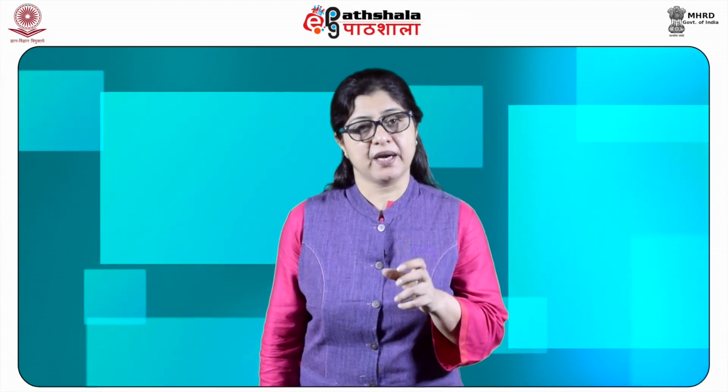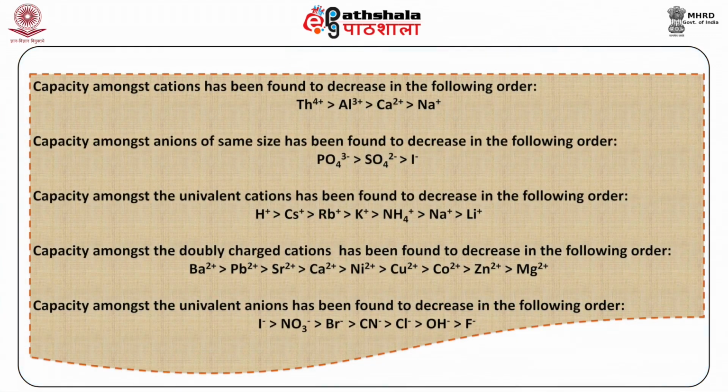If we compare hydrated ions of the same size, it is observed that the ionic charge plays an important role to determine their capacity to undergo exchange reaction. According to this view, the capacity amongst cations has been found to decrease in the order: thorium 4 plus is greater than aluminium 3 plus, followed by calcium and sodium ions. Similarly, the capacity among the anions of the same size has been found to decrease in the order of phosphate, sulfate and the iodide ions.